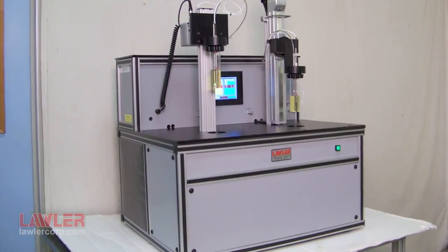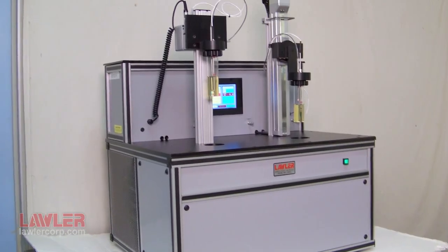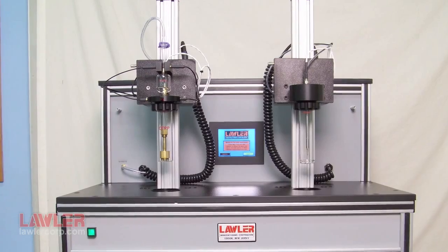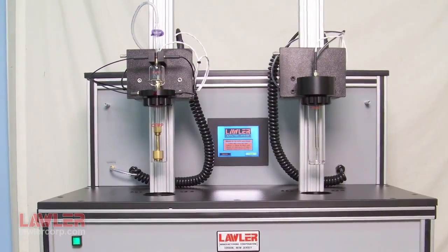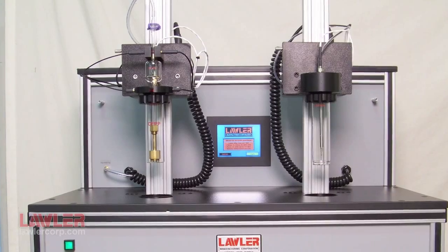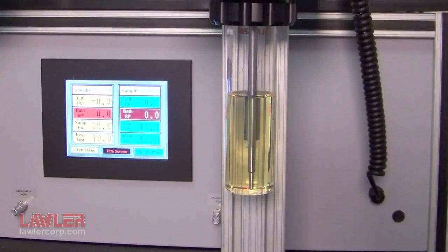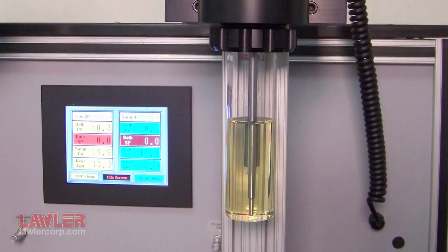Cloud point is the simplest and usually most conservative test. It is typically purchased with a second CFPP or pour point head. Performed manually, the sample is observed every degree as it cools. At the bottom of the jar, a cluster of hydrocarbon crystals will form indicating a cloud point. The automated head uses an optical sensor for detection and a sample temperature probe in place of the thermometer.